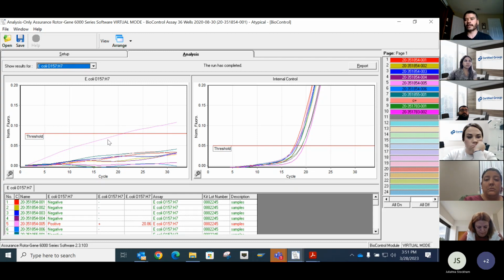What causes this is background fluorescence that the instrument is reading that never essentially decreases, so the algorithm will crunch this line, for lack of a better term, down below the threshold. There's just a lot of background, and we don't have great explanations for this, because you'll reanalyze the sample, and that background fluorescence will not be there, and you'll get a valid result.